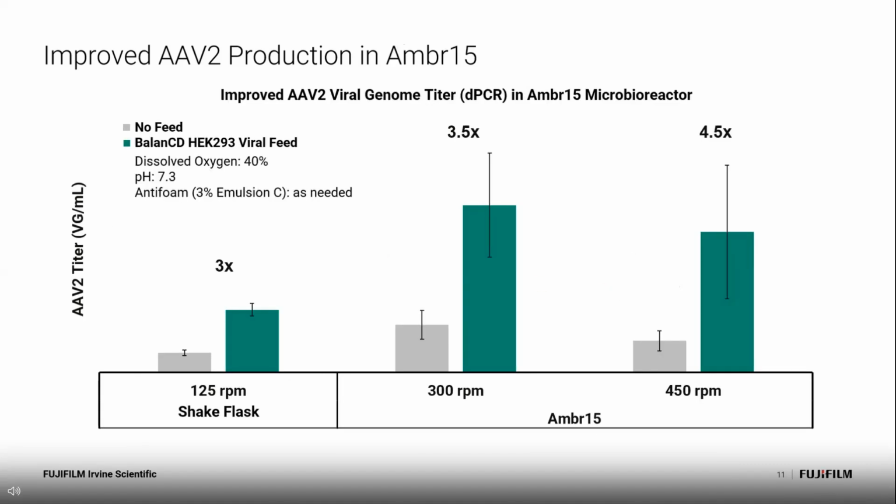We also would like to verify the effect of viral feed in bioreactors. First, we tested in microbioreactors. In this experiment, we would like to optimize the propeller speed for transfection as well as the performance of viral feed. Again, the basal media is balanced HEK293.